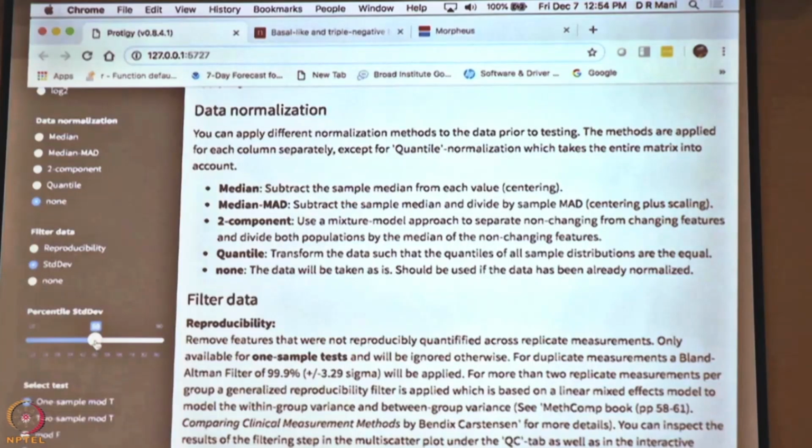So that has a high standard deviation. So you want to keep things that vary more, high standard deviation. And here you can pick what percentile of things you want to keep, so what fraction of things you want to keep. Just to make things fast, I'll pick 50. So usually 50 is a more aggressive number. You would throw away like the bottom 10 percentile, but I'm throwing away the bottom 50 percentile.